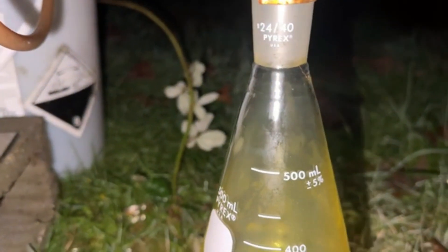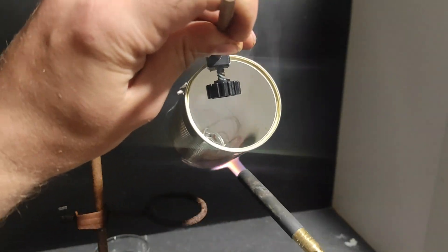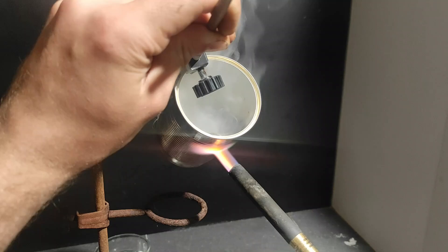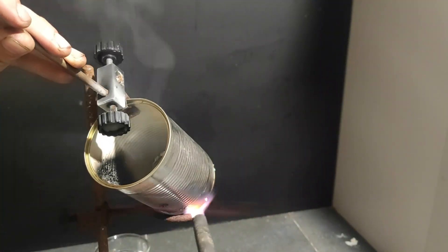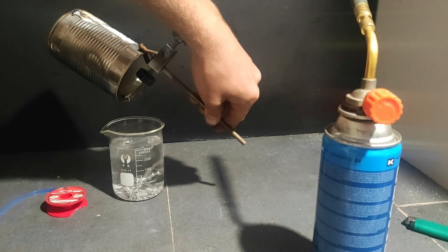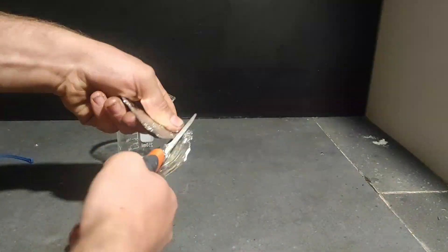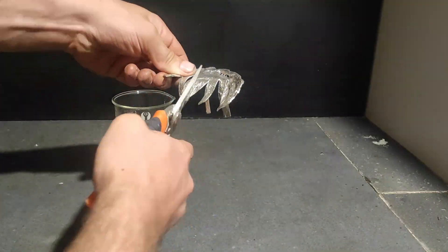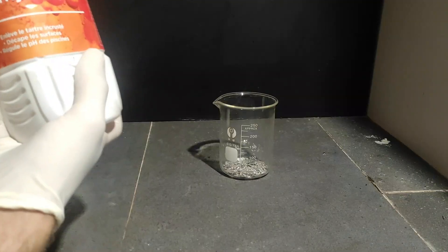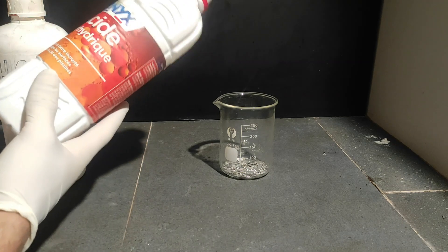Now let's make the tin tetrachloride hydrate. Technically you can make it by burning tin metal in pure chlorine gas, but I wanted to try another route. The first thing to do is to melt the tin into a small strip to make it easier to dissolve later. I tried to pour the alloy into water but it didn't work and just made a thick wire, so instead I made a little pancake which I later cut into small pieces. I put all of the pieces in a beaker and added a random excess of hydrochloric acid and a bit of hydrogen peroxide.